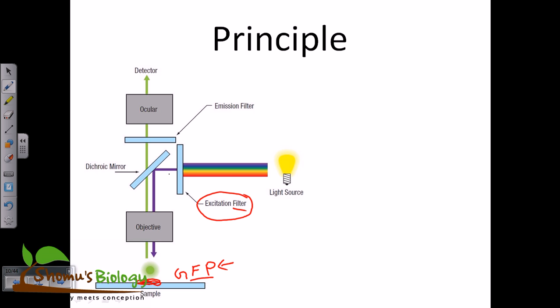But remember, once this blue light has passed through the filter, there is a mirror, acting through simple reflection, and this mirror is called a dichroic mirror. This is not a normal type of mirror that we look at; it is a specific, special mirror. Why is it special? Because normally in a mirror we just see the reflection of a particular light or anything. Here, the blue light reflects off the dichroic mirror and passes through the objective, finally to the sample, the specimen, whatever it is.